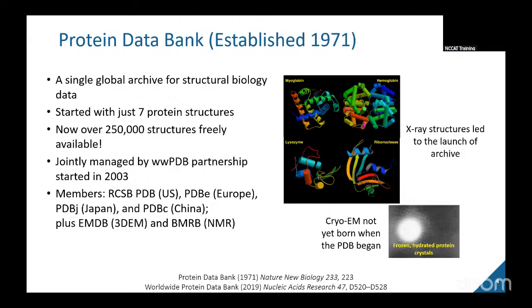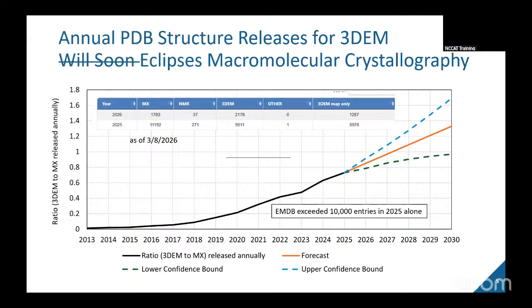And of course, Cryo-EM as we know it today, as you're learning this week, wasn't part of the story back then. It was around that time that they were doing these pioneering experiments to show that you could freeze and image biological specimens using an electron microscope without causing significant damage or distortion to their structures. Those early breakthroughs opened the door for the field, and paved the way for what's now been over 5 decades of continuous developments and improvements. Importantly, because of this, Cryo-EM has been completely transformed. It's no longer a niche technique. It's commonly used in labs around the world.